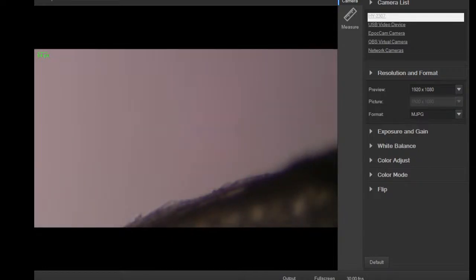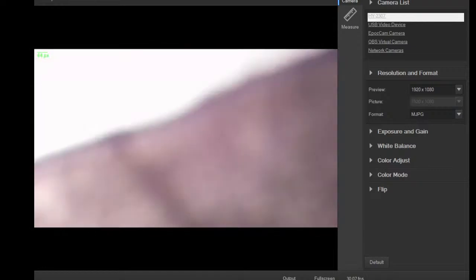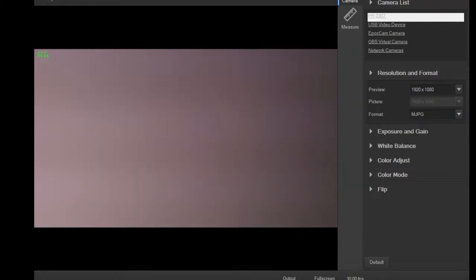And I want to try something else kind of random here. This is ground cinnamon. I like putting cinnamon on different things, so I figured, hey, let's take some cinnamon. It's just the bark of the cassia tree. Most famously grown in India, but lots of other places. And again, I'm just doing a dry mount here. So I'm going to take a little cover slip, put it over some of this powder. Try not to sneeze.